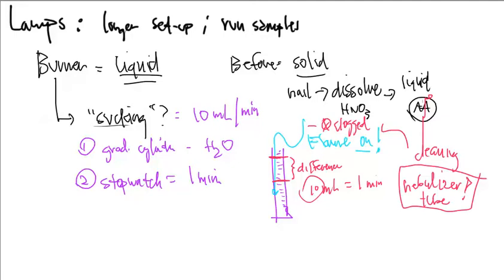I would try the 10 milliliters again, and if it's still not 10 milliliters, then there is a knob typically on the front of the machine. So I'm going to attempt to draw this. Let's say that this is my burner head, and this is where the flame is coming up from the burner head. Down here below the burner head, there's typically going to be a knob. And my plastic tubing will come into this area really close to it.